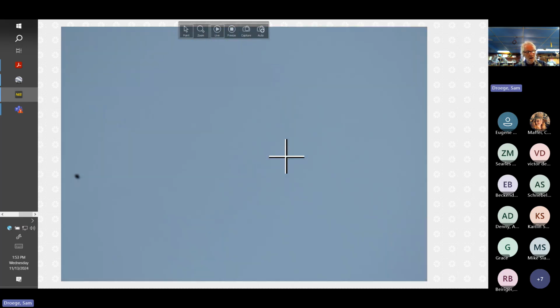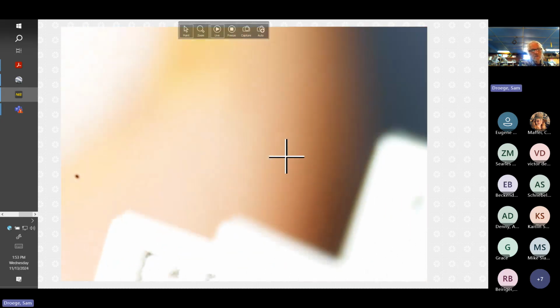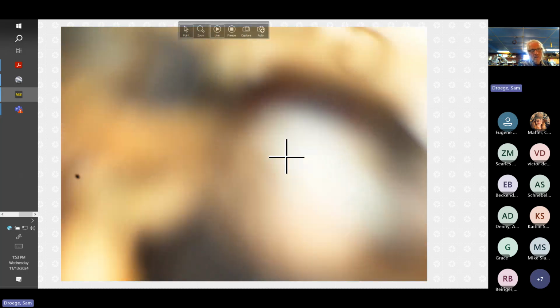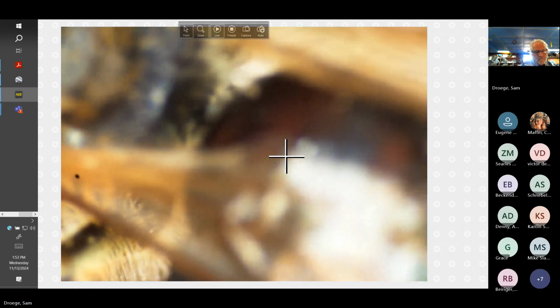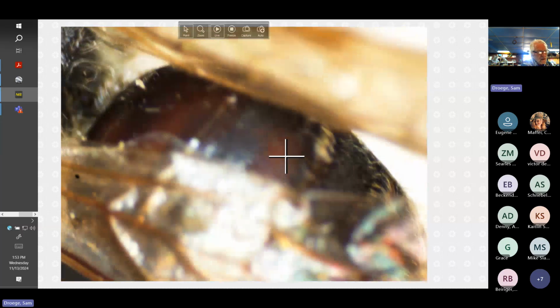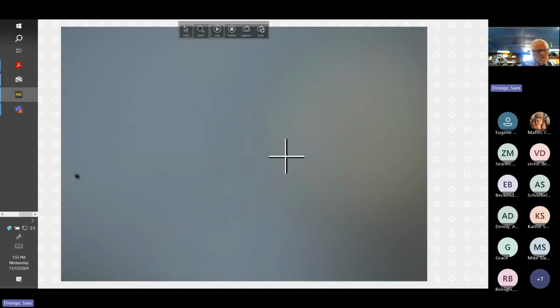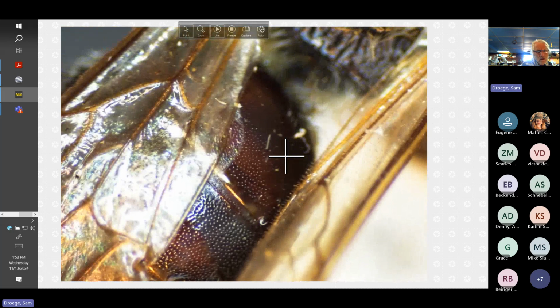All right, now the very most definitive thing will be what's going on T1. Should be very sparsely pitted compared to Heraclei, where everything is quite densely and very densely really pitted. This should have well-spaced pits. So much of the individual life histories of these bee species is still pretty murky. Like maybe it's on willow, but you look at the records, it's like, yeah, you caught it on willow, but lots of things get caught on willow.